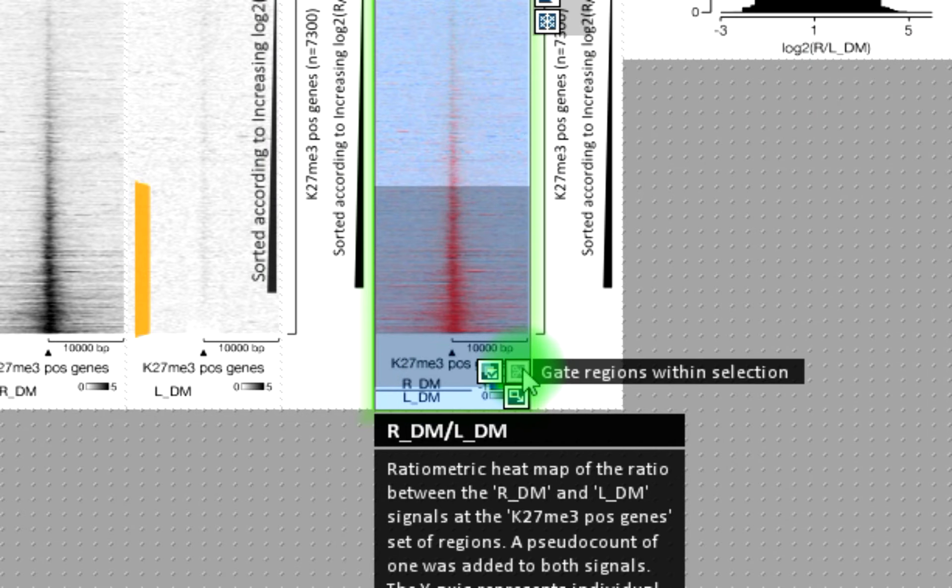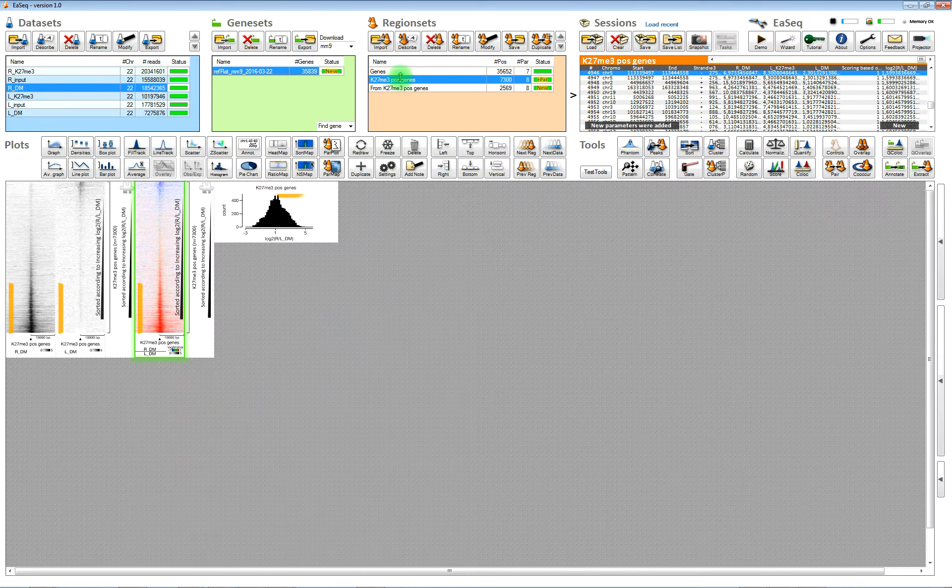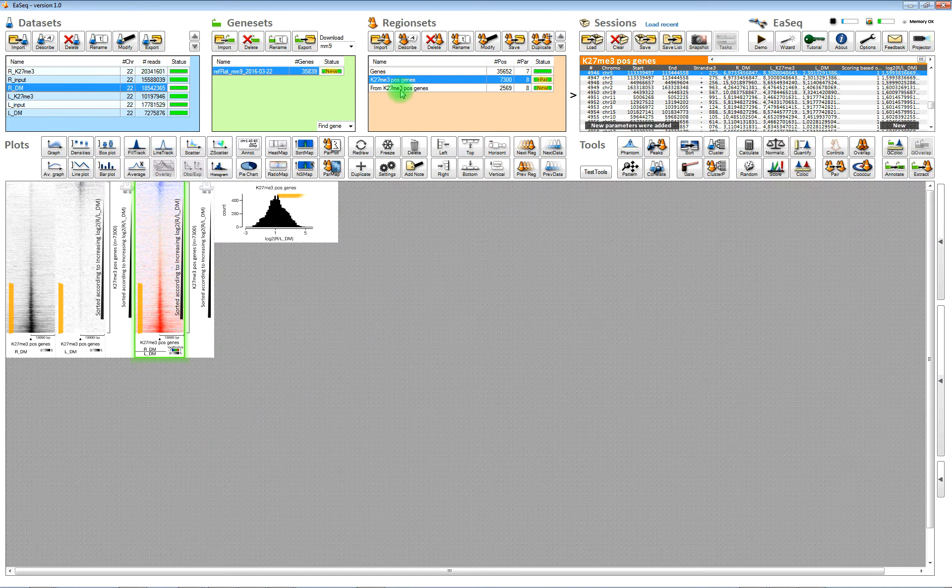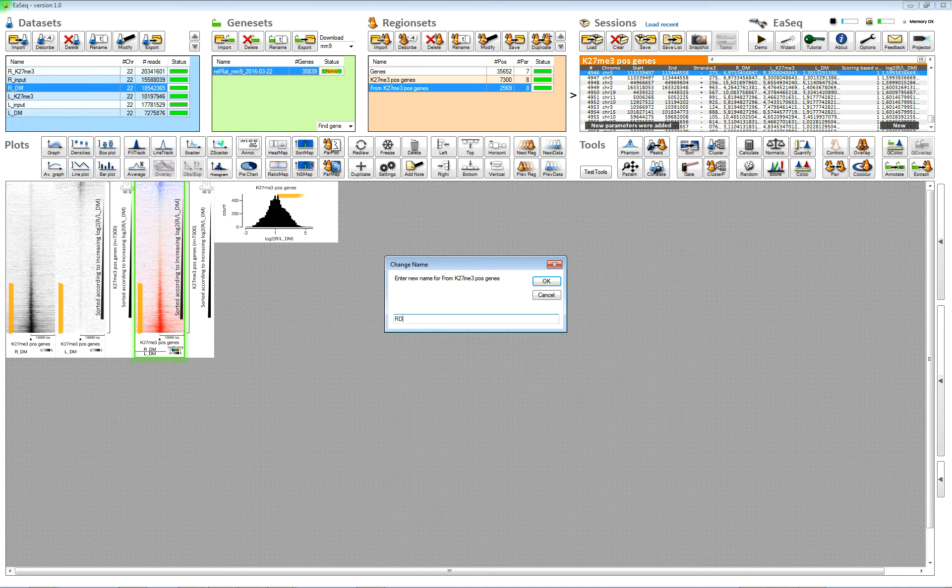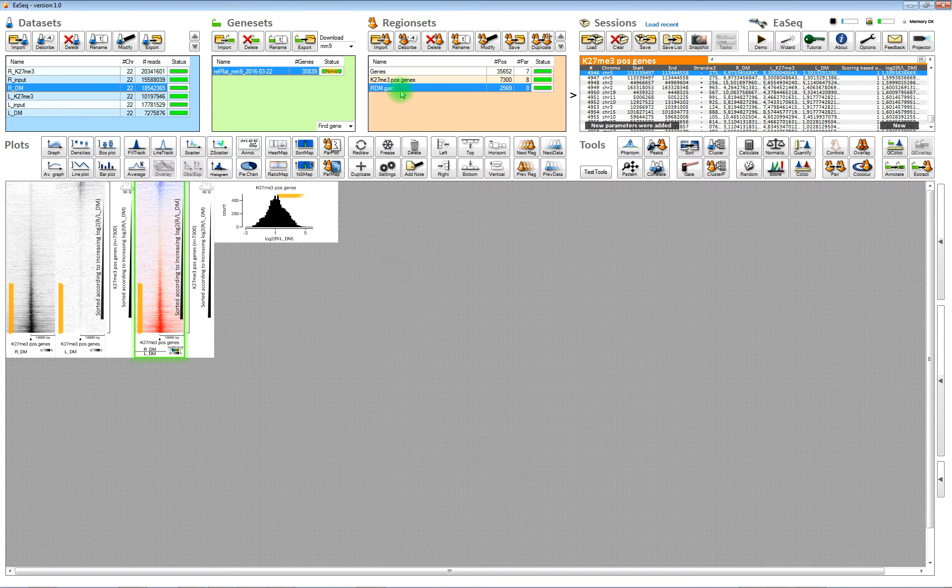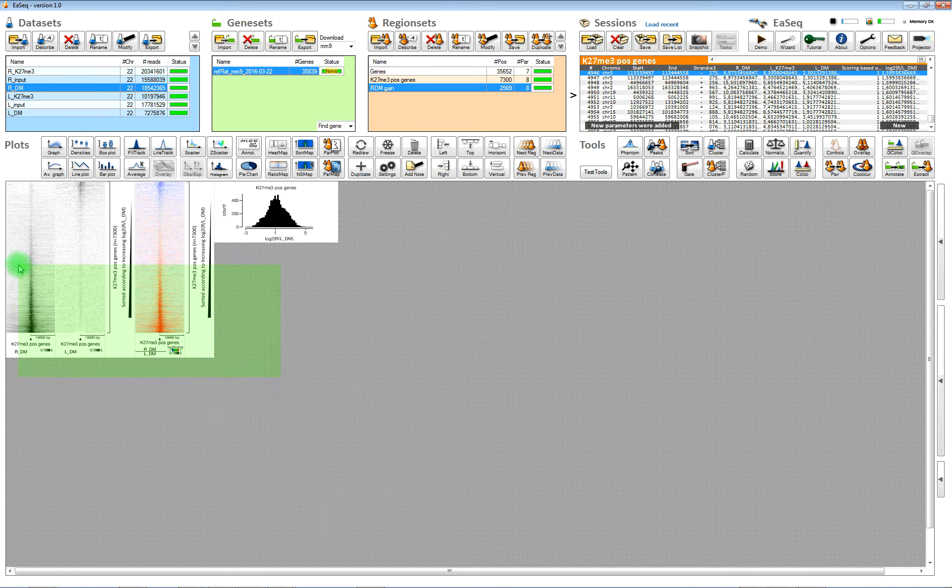And you can also gate out a subset of regions. Now we gated out those with the highest level of right side double mark relative to left side.